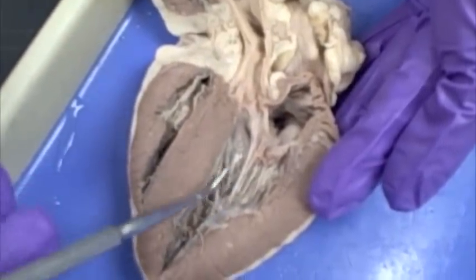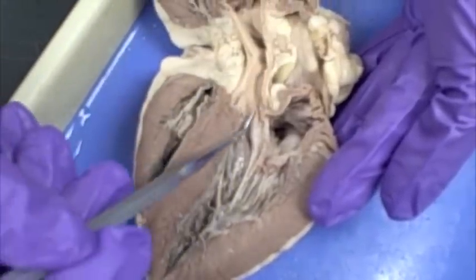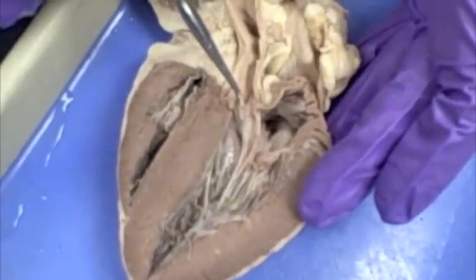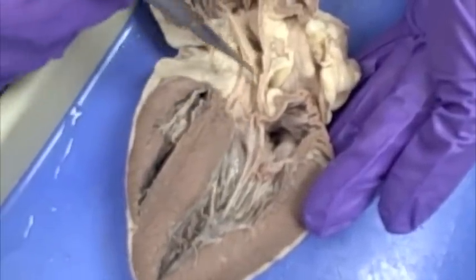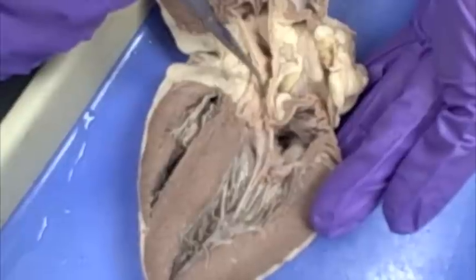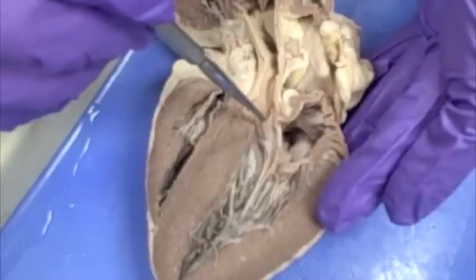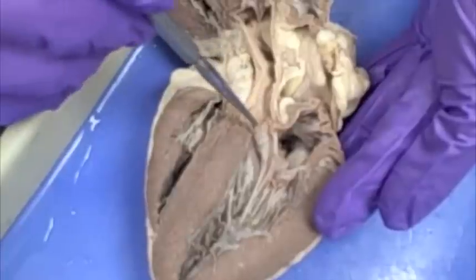Whenever the ventricle contracts and that valve closes, the blood is going to go in this direction — up into the aorta. So the valve located at the base of the aorta is the aortic semilunar valve. When blood goes this direction, see how smooth it flows — there's nothing impeding it. But whenever the ventricle relaxes and the blood comes back, it opens that valve like a pocket, fills up with blood, and closes that opening to the aorta so that blood does not flow back down into the ventricle.